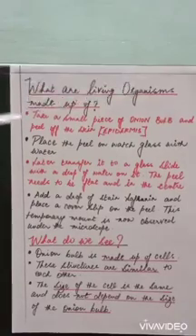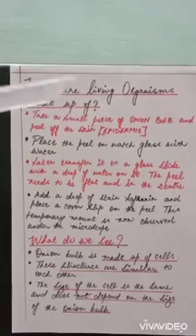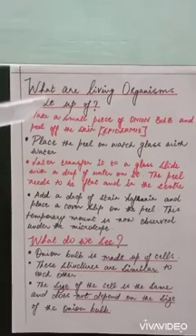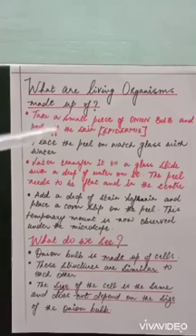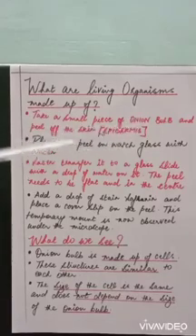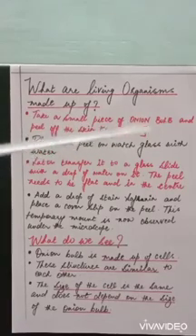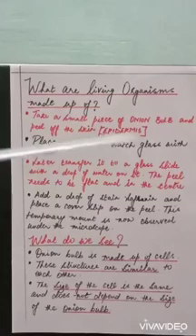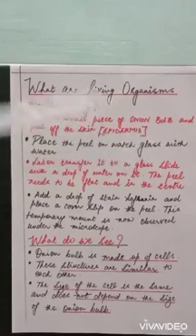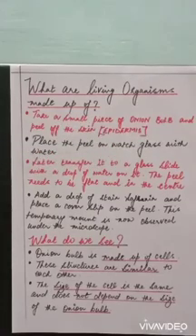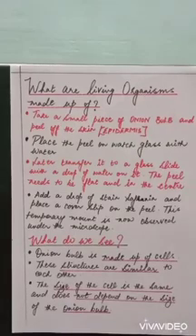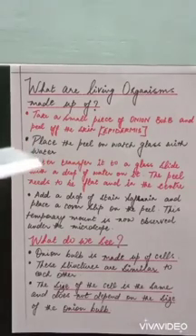What are living organisms made up of? Well, let's find out. Take a small piece of the onion bulb and peel its skin off. This happens to be the epidermal portion. A forceps may be used to carry out this process. Then, place the peel on a watch glass with water.